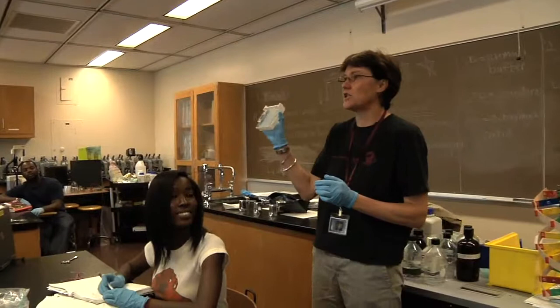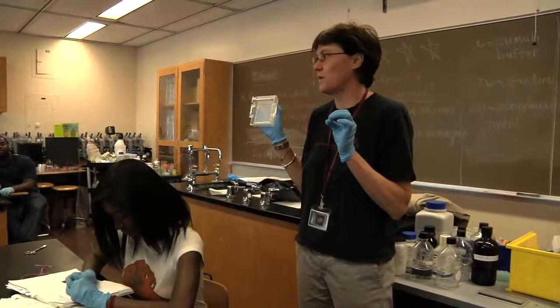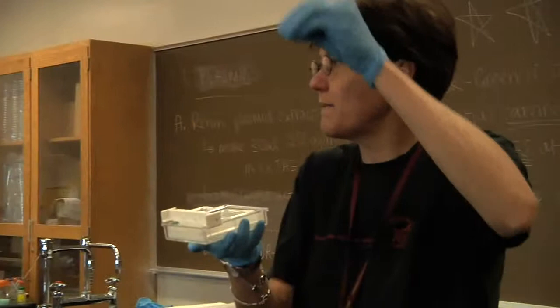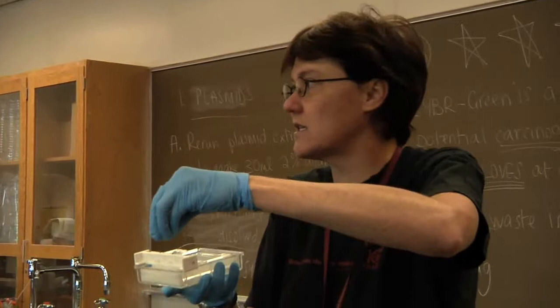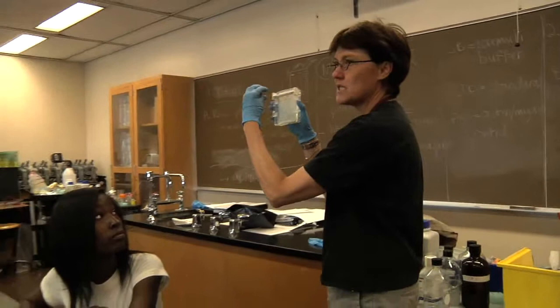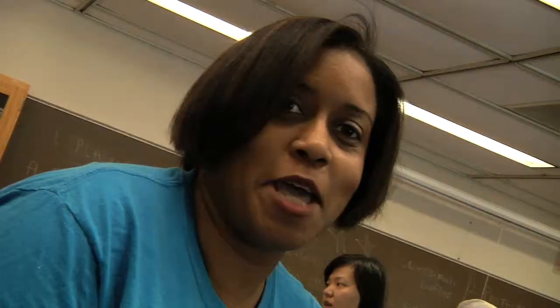Before we do that, we'd really like to get started on the DNA gels. I just checked that group and took out their gel comb for them. There's a trick to taking out the gel comb — you'll find it's quite firmly in there because the agarose has solidified. You're going to pull it straight up very gently. Don't wiggle backwards and forwards or from side to side because you'll break the wells. Just gently and consistently pull your comb straight up, pressing down on the edges with one hand and pulling the teeth straight out with the other.